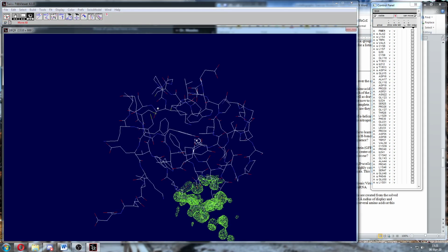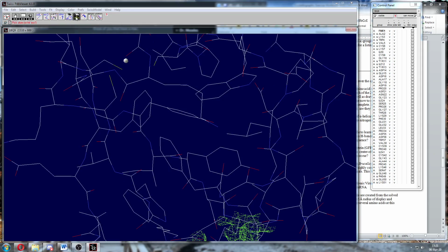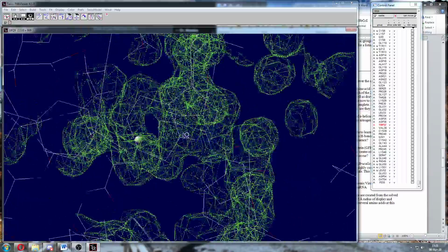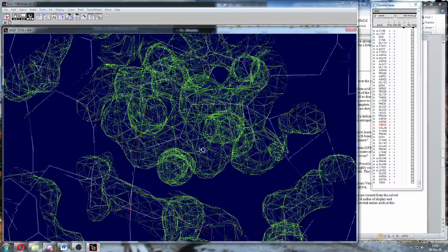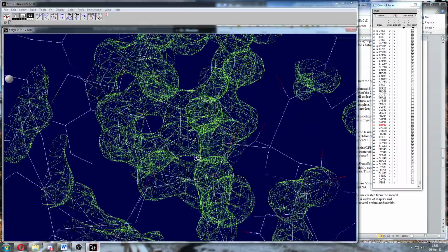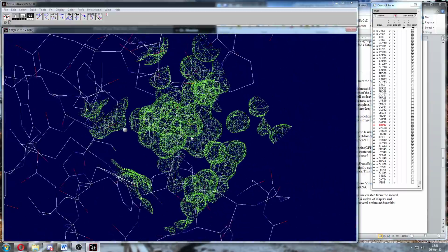And if I click on one of those tryptophans in the center, which we're fond of doing, and center on it, like there, you notice that it's again shrink wrapped onto the tryptophan, but now it's even tighter. You can actually see a hole in the 5-membered ring, because this is a much higher resolution map, meaning I have a better idea of exactly where the atoms are.